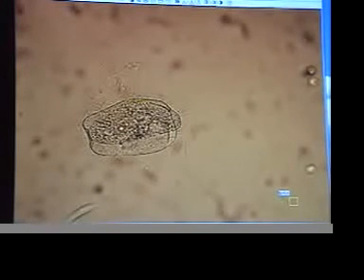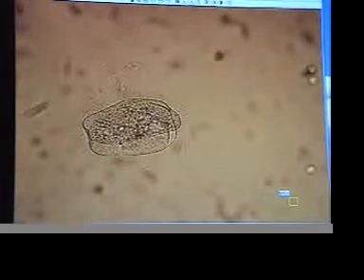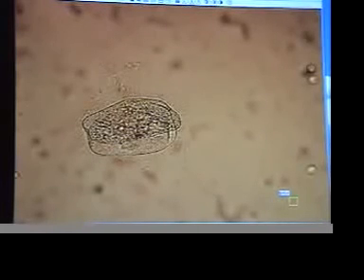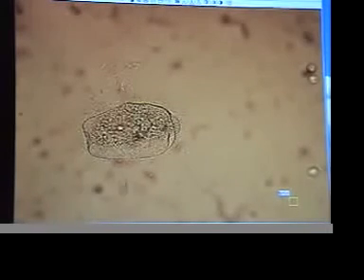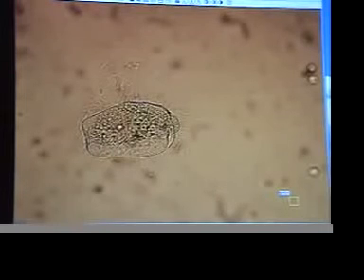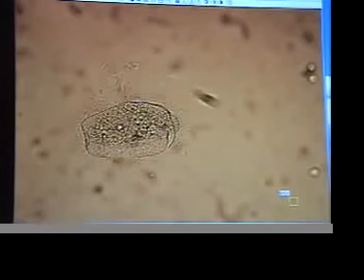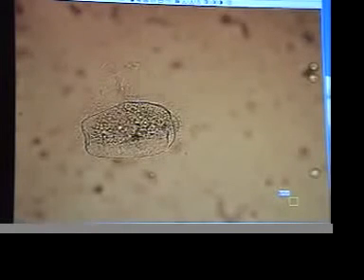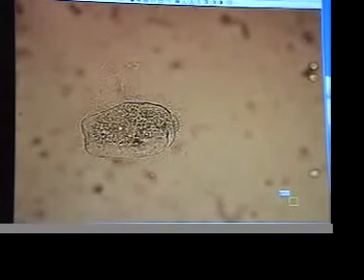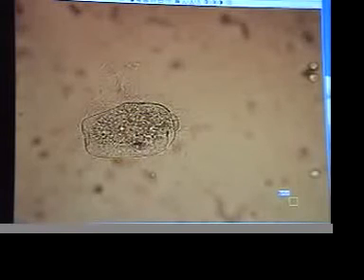We're definitely seeing morphological changes here. Paramecium caudatum, July 23, 2008, 1185 hertz, and the 11th harmonic, which is 13,035 hertz, 13,035, and we see internally a very large change happening.